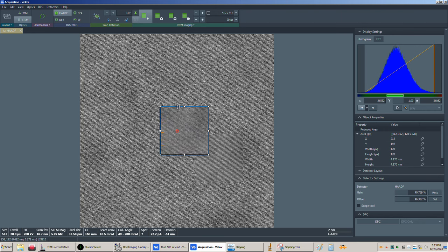The other thing we can do if we end up getting too lost, we may need to do this, is we can go back to stigmating from the Ronchigram, because it looks like I am doing just that. All right, so what we can do then is we don't despair.